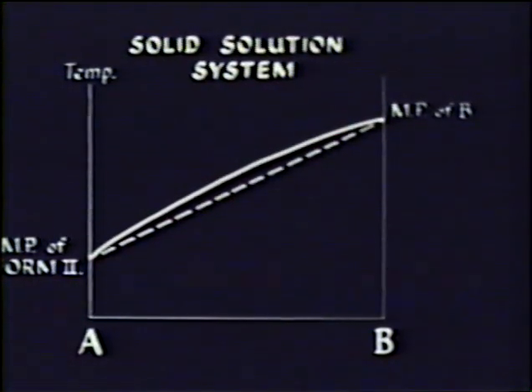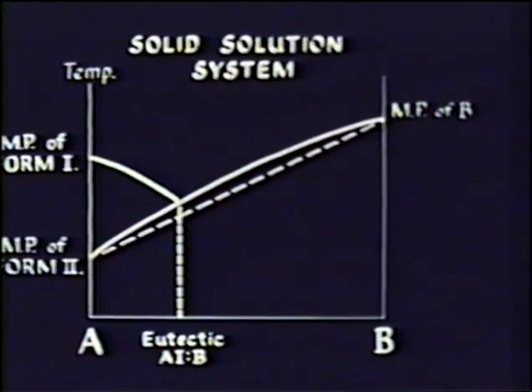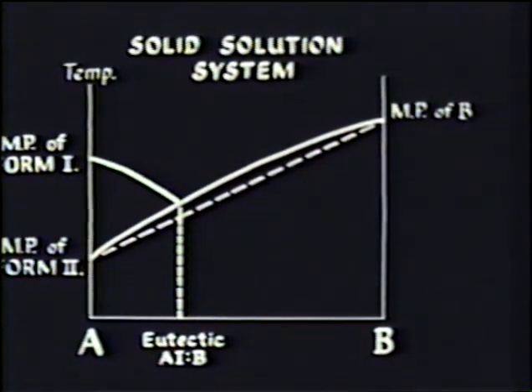Systems showing solid solutions between two isomorphous components are illustrated in this diagram. In the example chosen, the stable form of trinitrobenzene is isomorphous with the unstable form of picric acid. The unstable picric acid transforms almost at once to the stable form. This phase forms a eutectic with trinitrobenzene. Hence, the transformation stops at the zone of mixing.